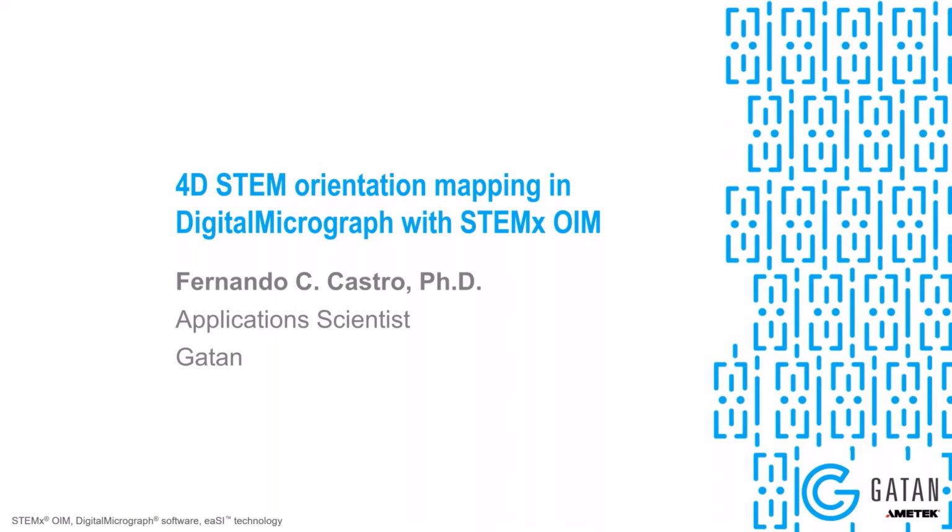Hi, everyone. Thanks so much for being here today. My name is Fernando Castro, as I was just introduced, and I'm really excited to be speaking with you all about our new product, STEMx OIM, which brings orientation mapping to 4D STEM data that you can acquire and analyze directly inside DigitalMicrograph with your Gatan hardware. So I'll provide an overview of STEMx OIM, have a couple of quick tips about collecting data for STEMx OIM, and we'll have room for questions at the end.